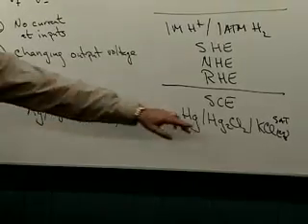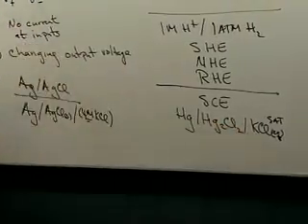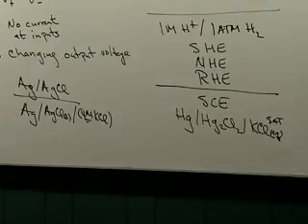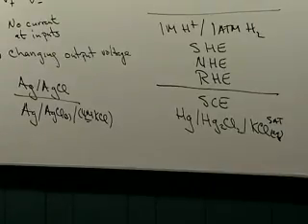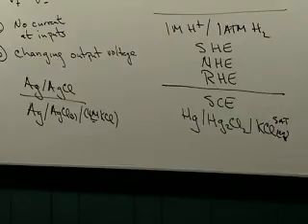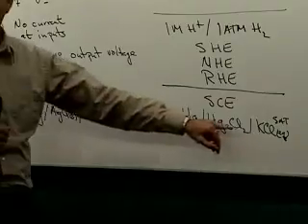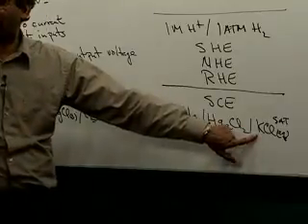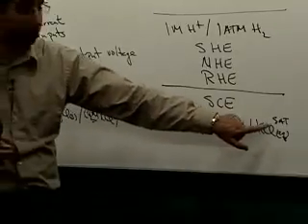However, it turns out potassium perchlorate is much less soluble than sodium perchlorate. And as a result, if you take your wonderful brand new SCE and let it sit in a solution of sodium perchlorate for a few hours, you will start to precipitate potassium perchlorate in the reference junction, in the frit. And you go from high resistance to ridiculously high resistance when you do that, and you have to start with a new reference electrode after that. So in that case, what you would like to do is substitute sodium chloride over here. Obviously, that couple doesn't matter whether it's potassium chloride or sodium chloride.